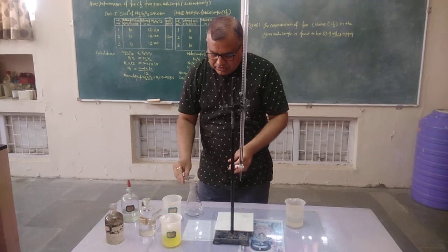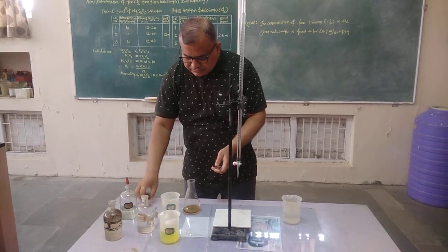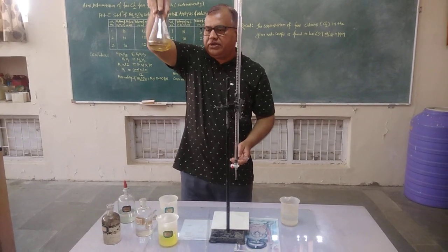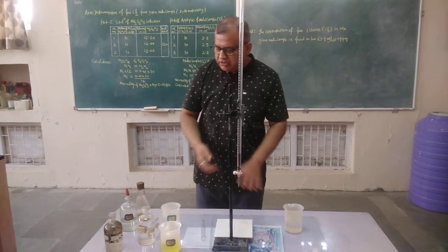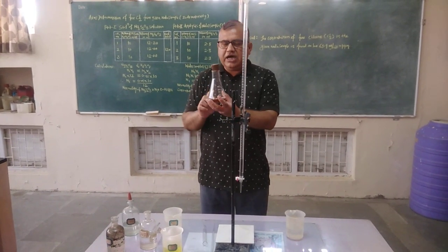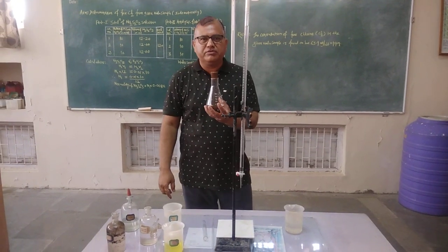And again wait for 1 to 2 minutes for the liberation of iodine. See, this iodine is generated now, and in the second part, I have already explained to you the theory part of this experiment, that during this second part, the iodine generated will depend upon the chlorine present in the water sample.